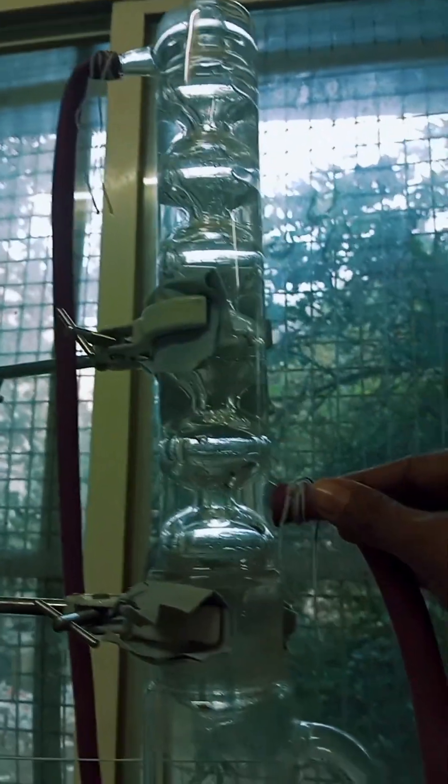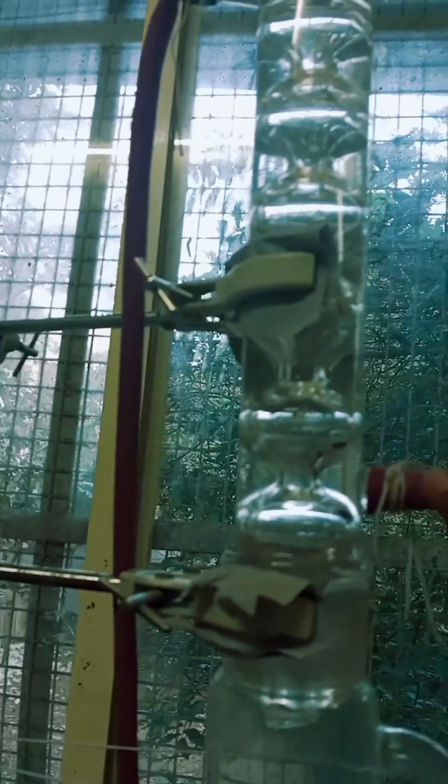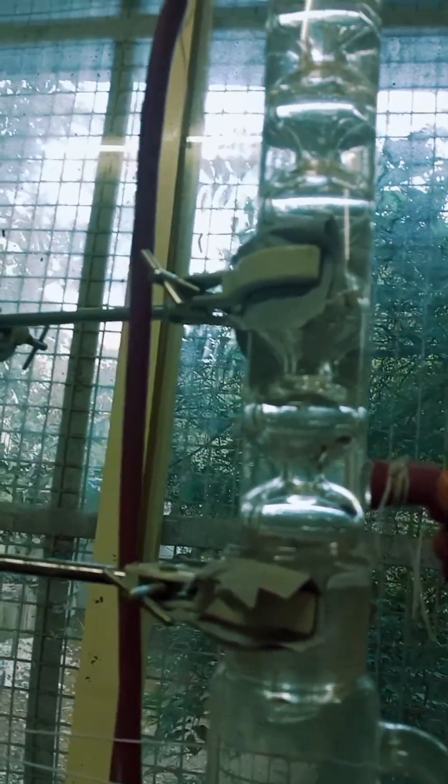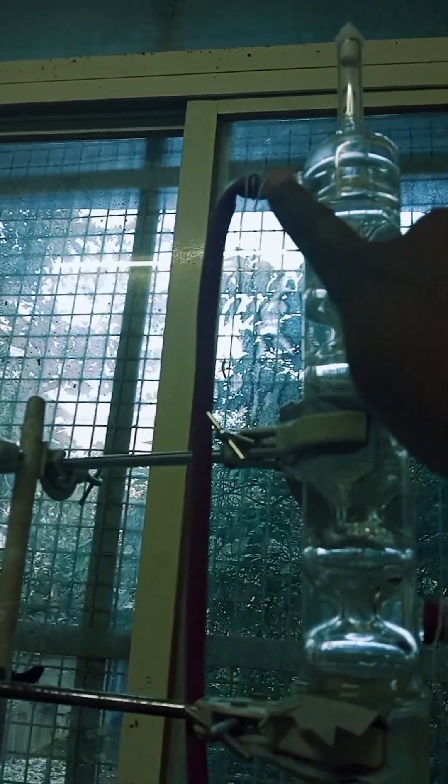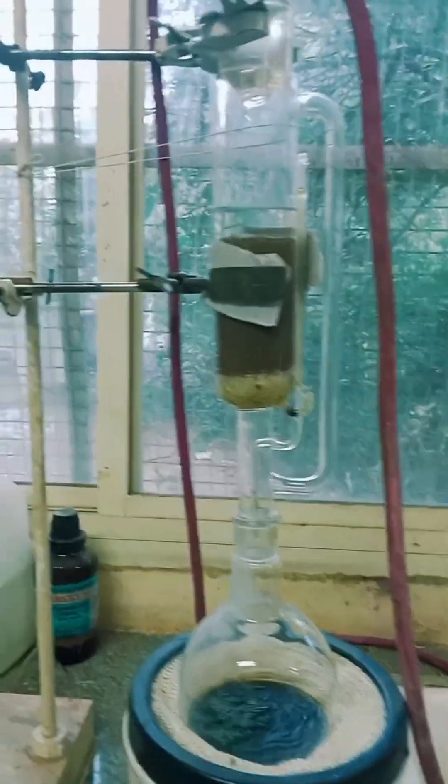This is the condenser. This is the cold water inlet, and this one is the outlet. From here, the cold water goes inside, and from the outlet, the hot water goes outside.